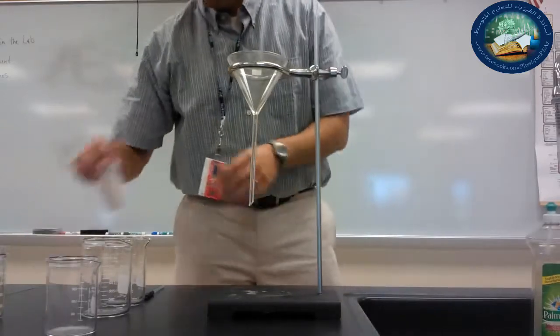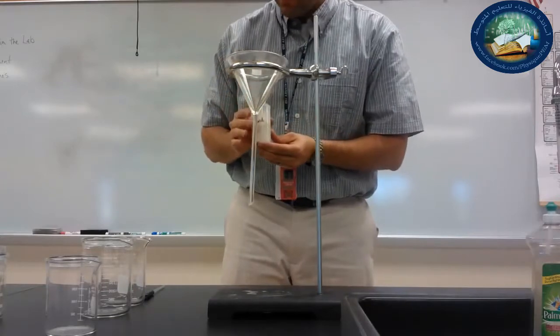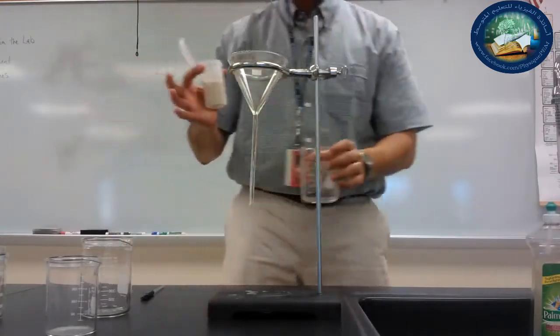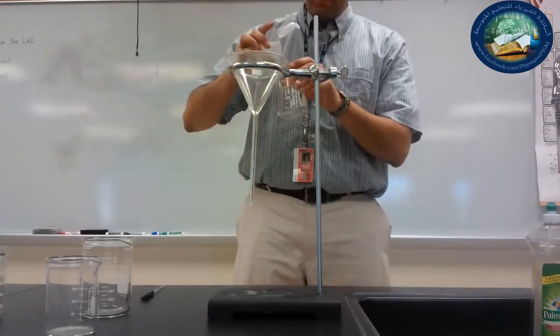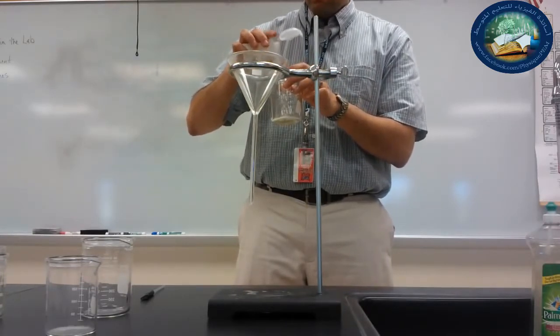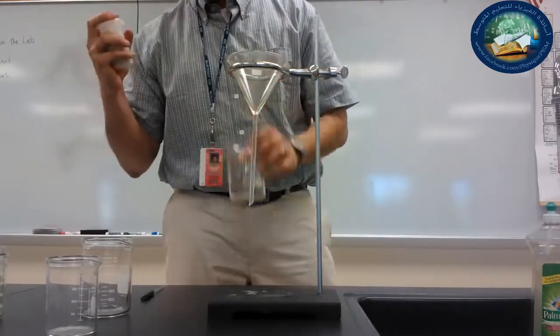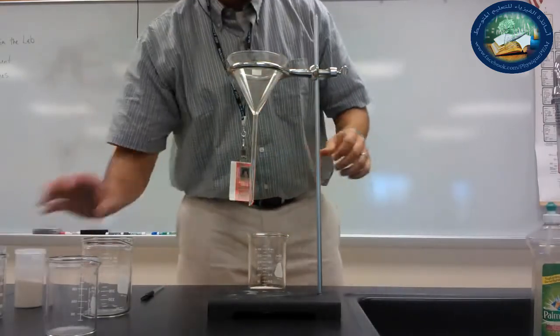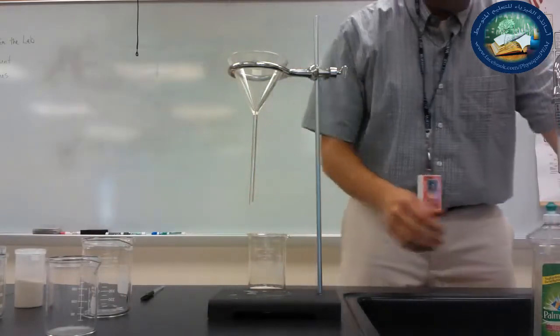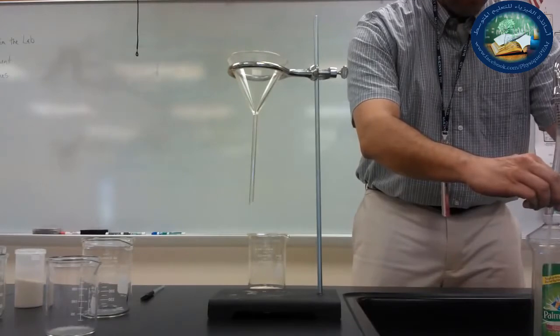that does not dissolve in the water. So what I've got here is some sand. I'm going to place this sand in this beaker. I'm placing some sand in the beaker, and now I am going to add some water into the beaker.